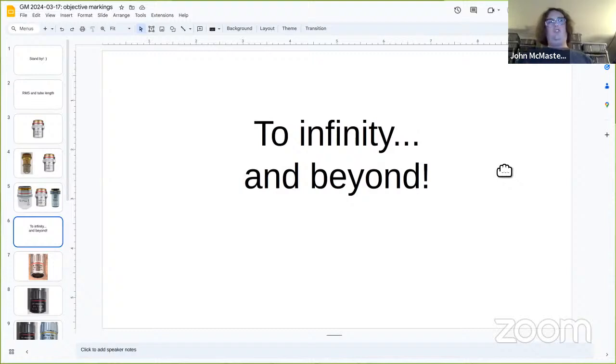What if instead of choosing a focal length like 160, 190, 210, we said, let's focus the objective at infinity instead. And then we have something called a tube lens in the microscope that takes that infinity-focused light and focuses it at a finite distance. So for example, the objective now is focused at infinity coming out of it. And then you say, you know what?